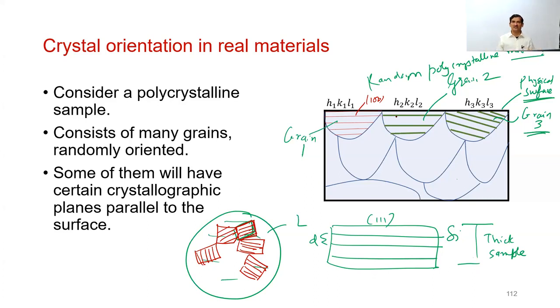So this is the status. Whenever you look at any material, very rarely would we have all crystals perfectly aligned with the same orientation. In fact, we need to work extra hard to do that, to get single crystals or really textured materials with preferred orientation. If you take a random piece, if I section this pen and look at it, this is what we would see: grains all randomly oriented. They may be the same crystal structure, but they are oriented differently. It could be a 100 face parallel to the surface, it could be 111, it could be 221 and anything.